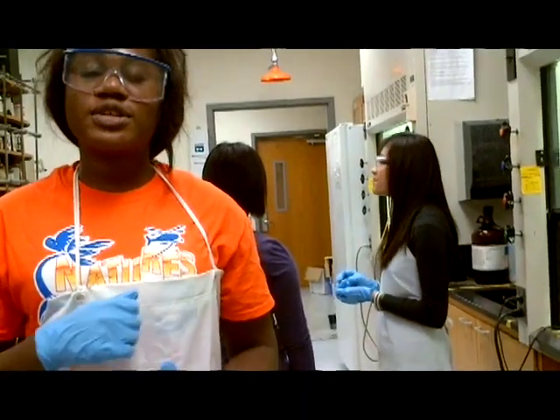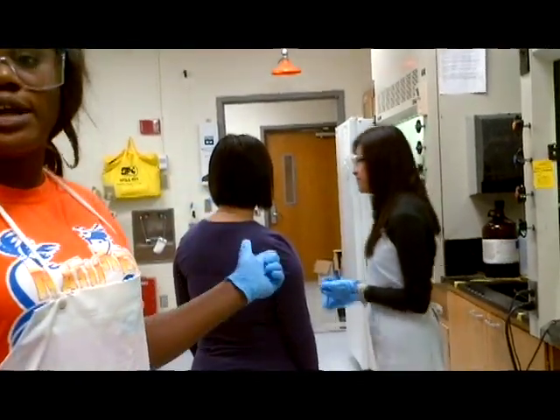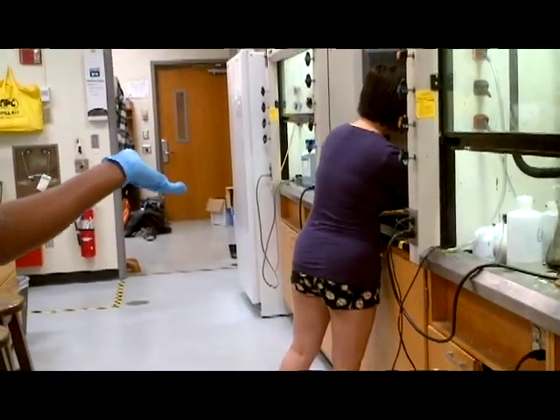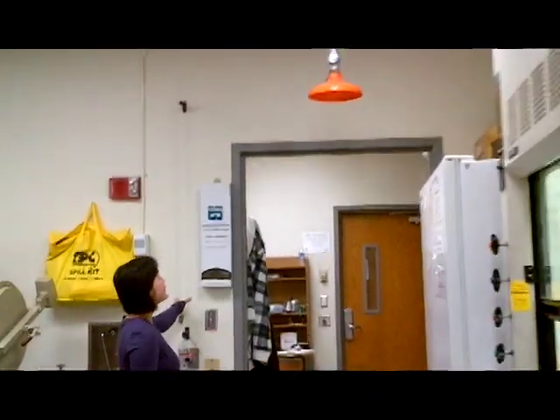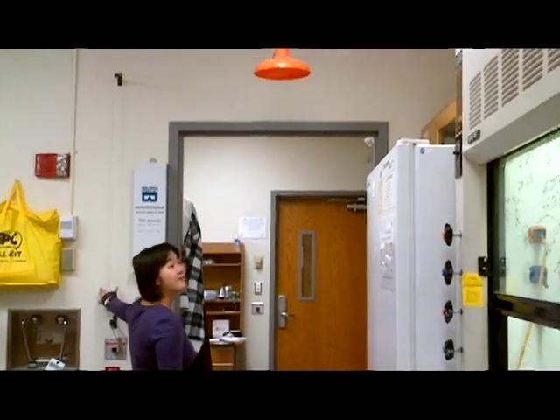So she just got acid poured on her legs, and the first thing is Janice is going to go get someone in charge. That could be a TA or a professor or a lab instructor. So she now is going to quickly rinse stuff from her hands, because that's the closest area for her. Go towards the shower, which will release a lot of water and completely remove all the acid from her body.